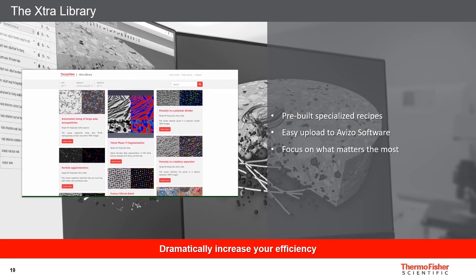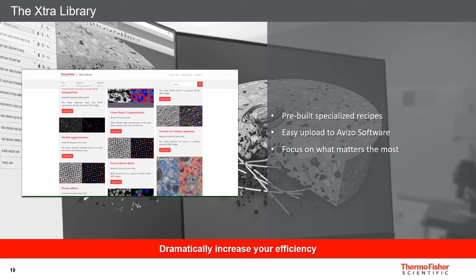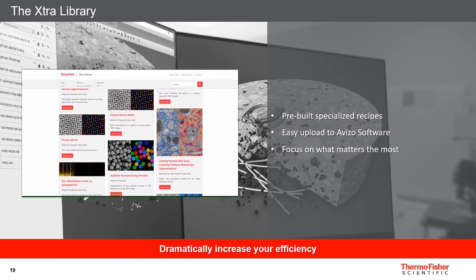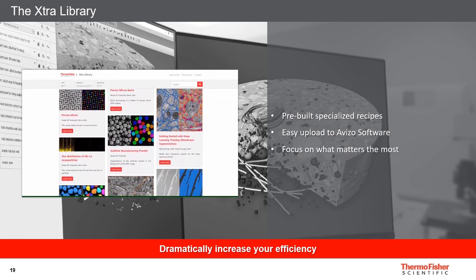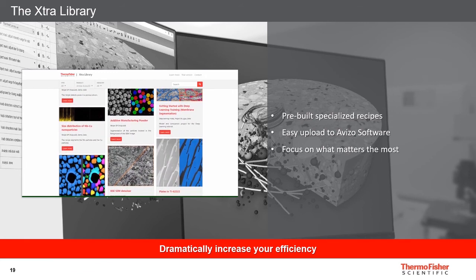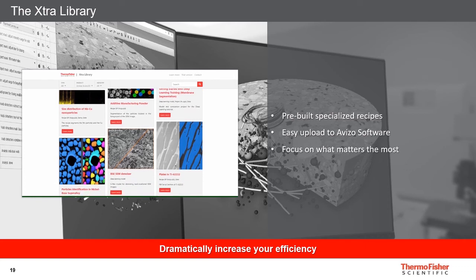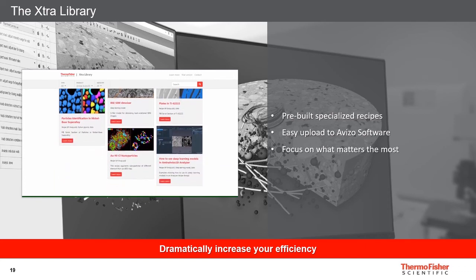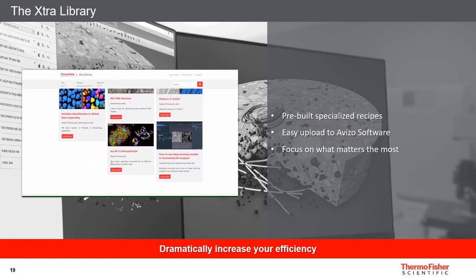To conclude this presentation, we want to highlight the Xtra Library. It is a free online portal that provides a collection of add-on recipes, scripts, and demos dedicated to specific use cases and workflows. Recipes accessible via the Xtra Library can easily be uploaded to Avizo software with just a few clicks. This will allow you to shorten your time to results and focus on what matters the most for you, to dramatically increase your efficiency.